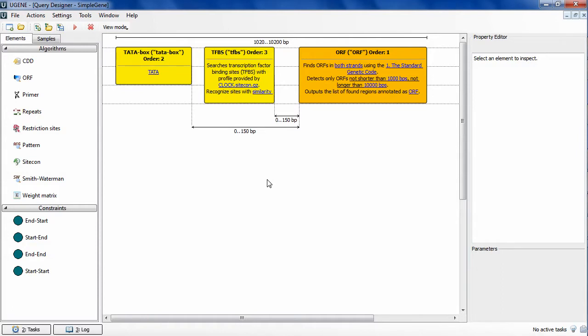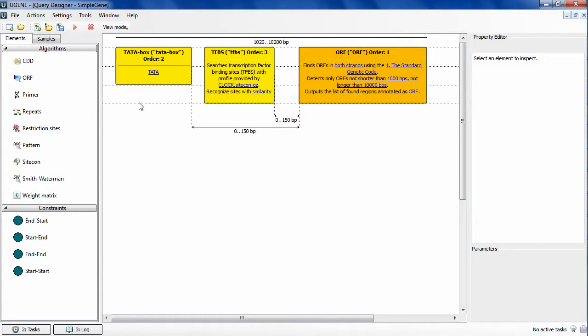Let's create a query schema that will find ORF regions with TFBS region and a TATA box upstream from it. A binding site is considered as a promoter on this schema, and a genome region matching this simple schema, a region that we search for, might appear to be a gene.